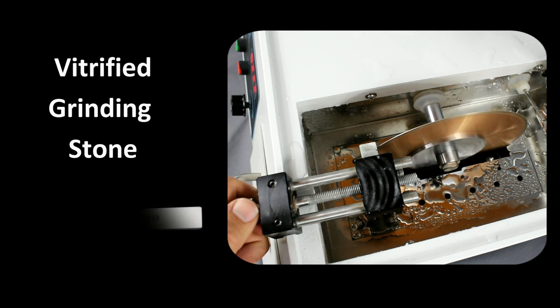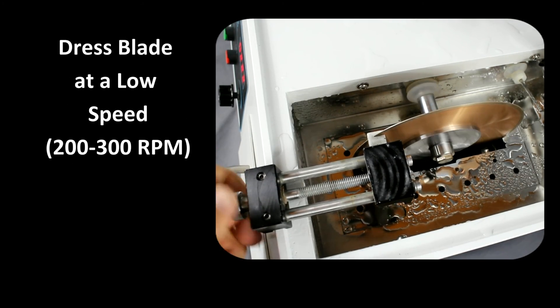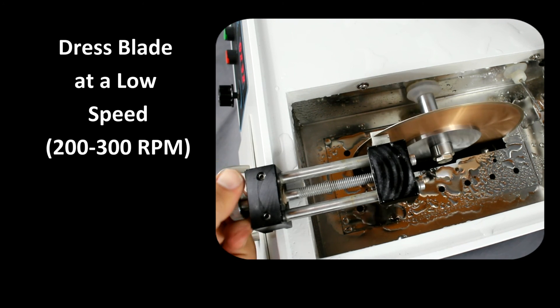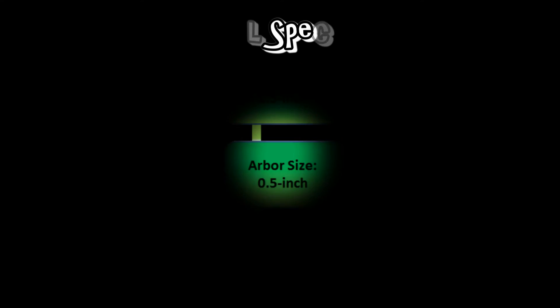Dressing is accomplished with a vitrified dressing stone. The dressing stone is slowly fed into the blade at a relatively low blade speed of approximately 200–300 RPM. Note that if the speed is too high, then we are only cutting the stone, not actually allowing it to clean the smeared metal off the abrasive surface.